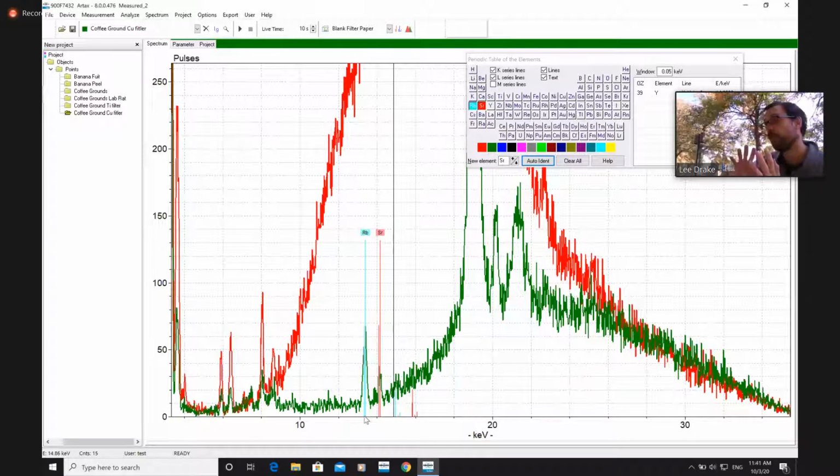Now, just to give you a heads up, when we move over to analyzing museum artifacts, we're going to want to use general mode to start with because we don't know what we're going to see, right? It could be arsenic, it could be lead, there might be chlorine. That's one of the challenges. If you have a salt wash, and I use a filter that's optimized to see just arsenic in a museum collection, I'm going to rub out all my chlorine, and then I'm not going to have my alternate hypothesis to confirm. And by the way, if there's arsenic or mercury in a museum object, there's going to be no ambiguity in the spectrum. It's going to be a massive spike. So we're going to be using general for most of today. Generally, you start with general. As your questions mature, your analysis can winnow down. So I hope that answers your question, Anonymous.